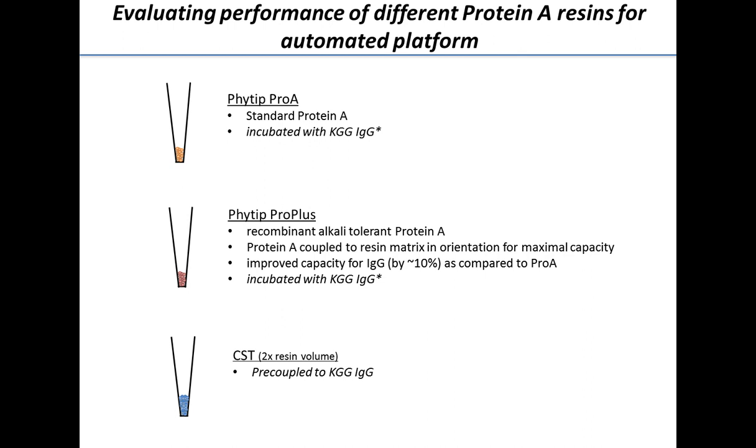And then for this study, we also included CST's pre-coupled KGG antibody to the resin. I wanted to mention here that for this experiment, we matched the antibody input amounts, and that resulted in the CST antibody being used at twice the volume as the Pro Plus and the Pro-A.